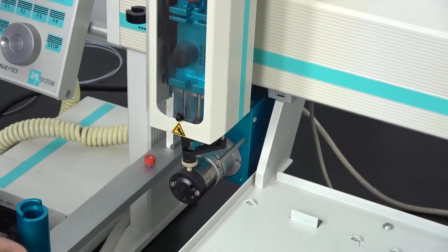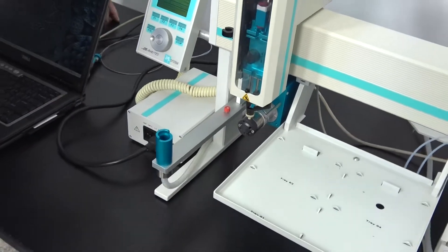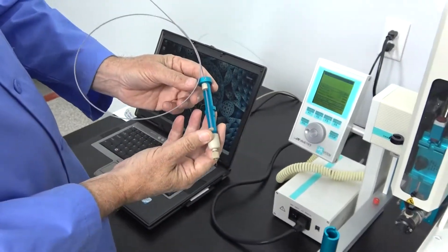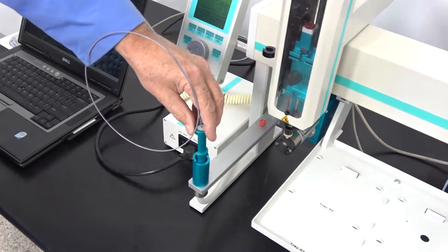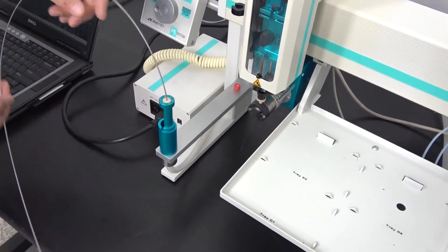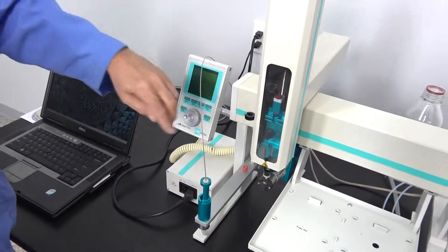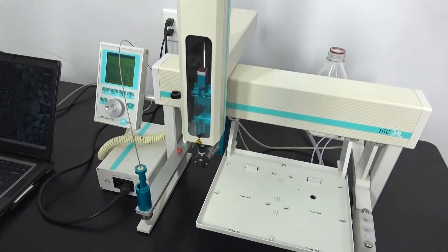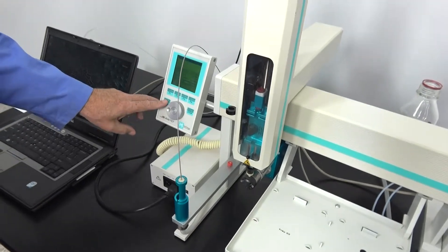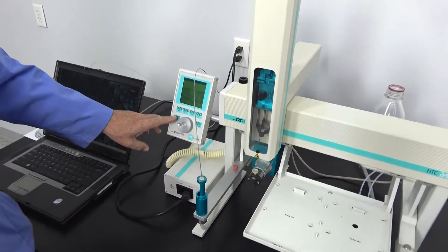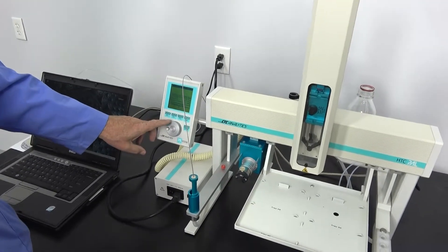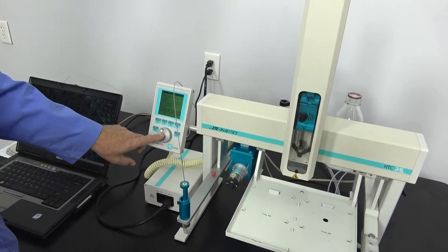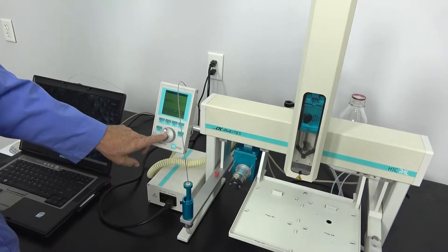This particular unit is configured with a MALDI auto sampler. Although it does take optional software, which is not included in this system, the MALDI will be included with it. That is your tool there. That would be hooked into your system. This then becomes the tool attachment. The unit will actually go and pick it up and it is configured in the tools.